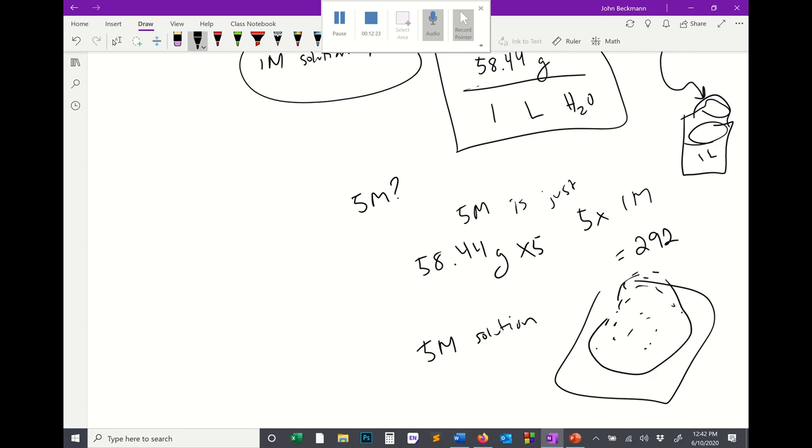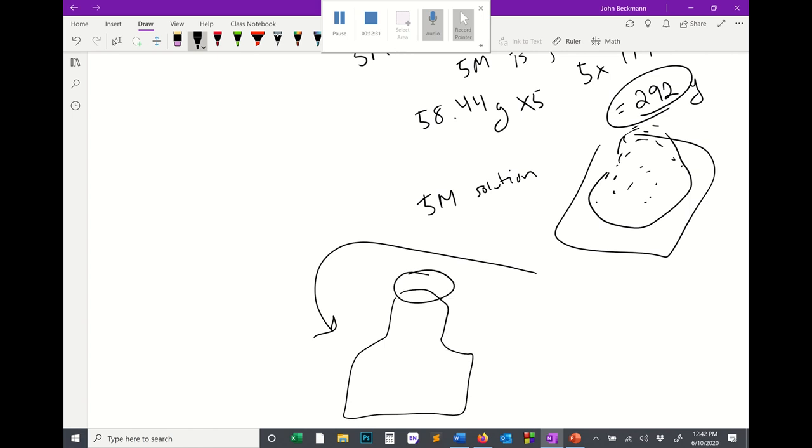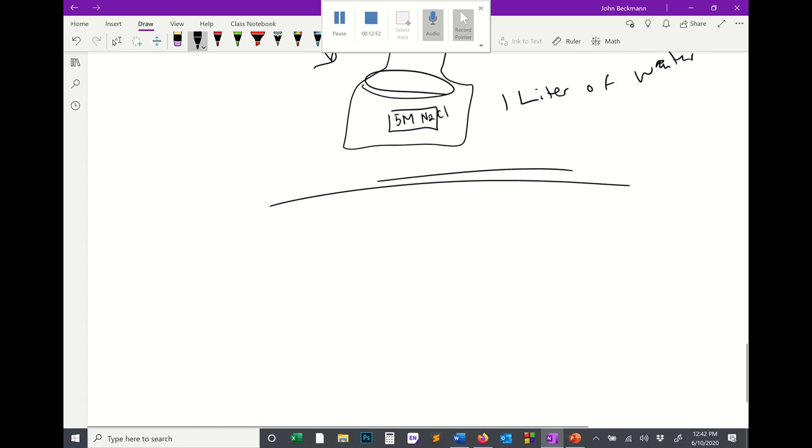of powder that weighed 292 grams, and we would take that powder and put it into a solution of 1 liter of water. And once all that powder was dissolved, we would label it as 5-molar sodium chloride. Okay? Now, a couple things about labeling your bottles.